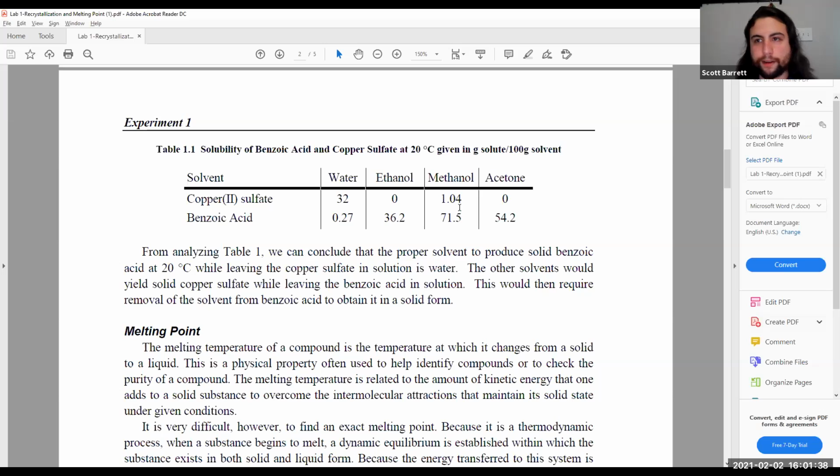You would also have different sorts of solvent systems that you can work with in an organic setting, where you can have a benzoic acid and maybe a benzoic ester that you wanted to separate, and you could use a mixture of ethanol and methanol at 10%, 20%. That's the main methods that we use in our lab.